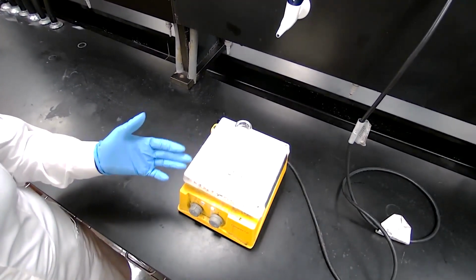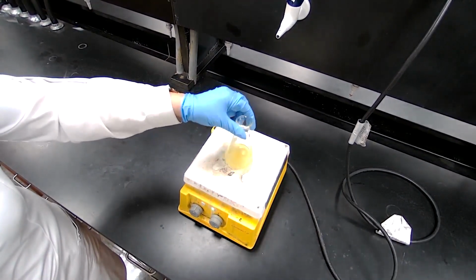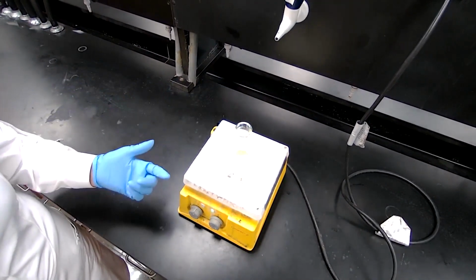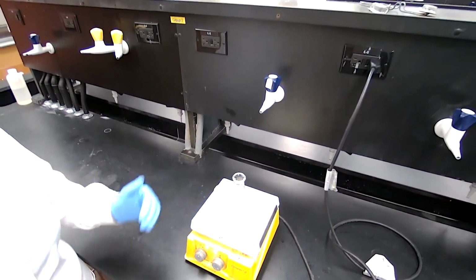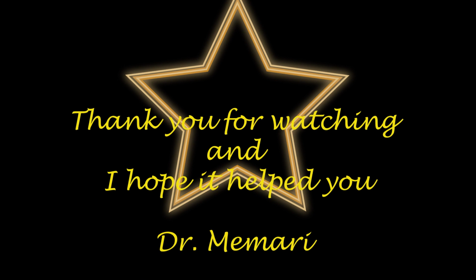So since it's going to take about 30 minutes, we are going to pause the video at this point and come back in 30 minutes to check the color of the product.